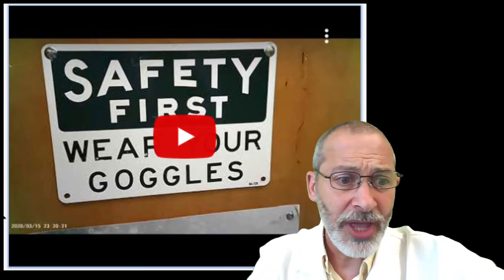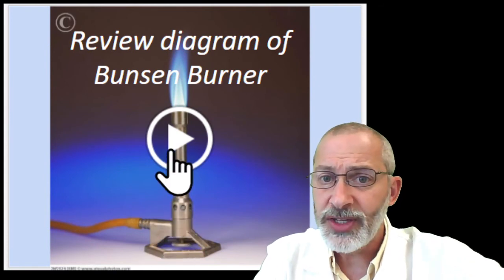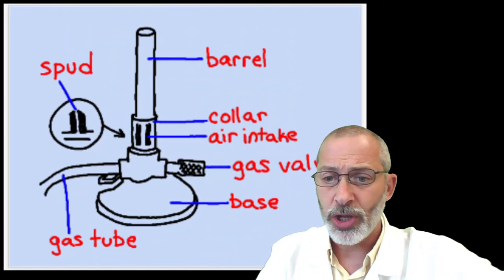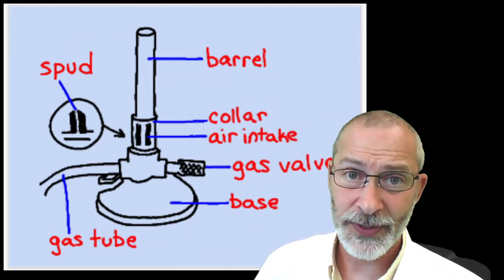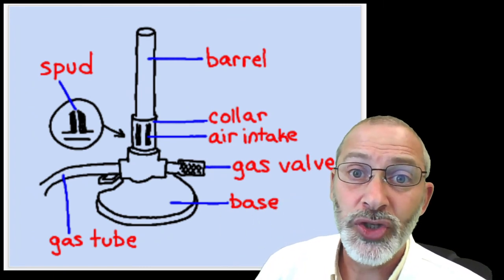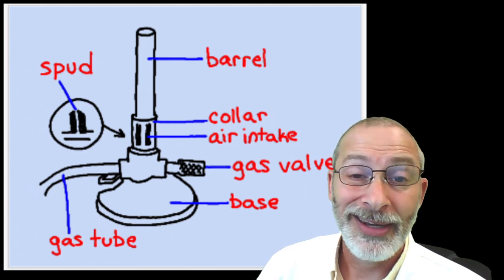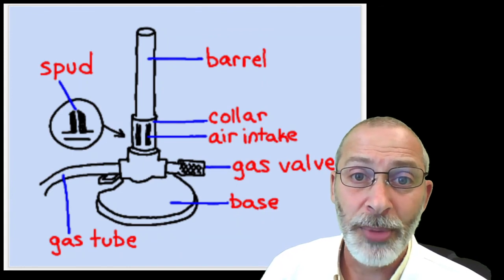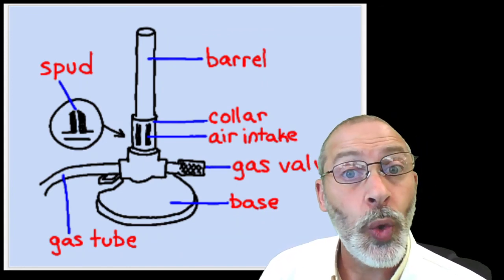So I've gone through that information rather quickly. On your own, you can watch this video on the Bunsen burner, but I would like to close today by emphasizing the importance of memorizing the different parts to a Bunsen burner in case I need to draw your attention. Not even in case. I will be drawing your attention to the different parts of the burner, and you will have to follow my instructions quickly.